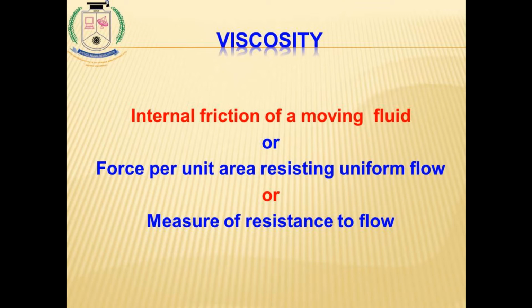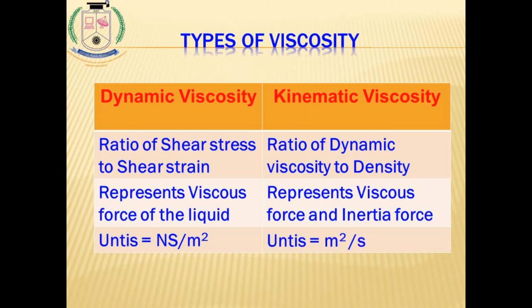I think with these definitions, you can understand what viscosity is. It is an internal friction of a moving fluid, or the force per unit area resisting a flow, or a measure of resistance to flow.